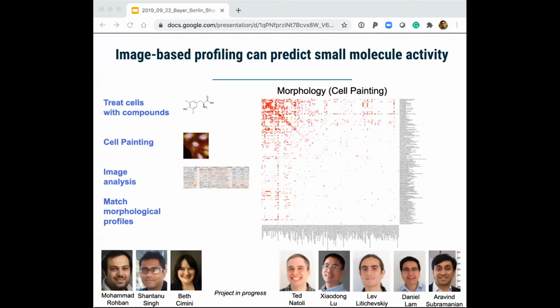But more recently, the connectivity map team at the Broad ran a pilot study using more than 1,000 compounds from a much more diverse set of classes of activity. And here, given that many compounds' mechanisms are unknown or even overlapping, we do not expect to see a strong diagonal. So we've ordered the rows and columns to put the categories of compounds with the strongest signal to the top left. And we see a decent proportion of categories yield a signal along the diagonal, and also that some categories show similarities to other categories.